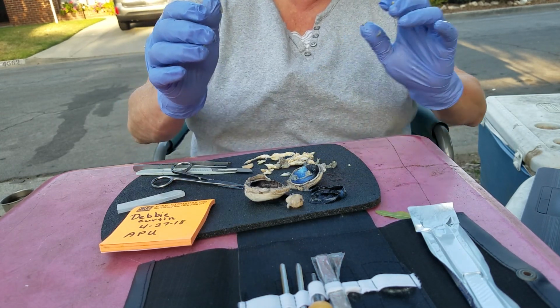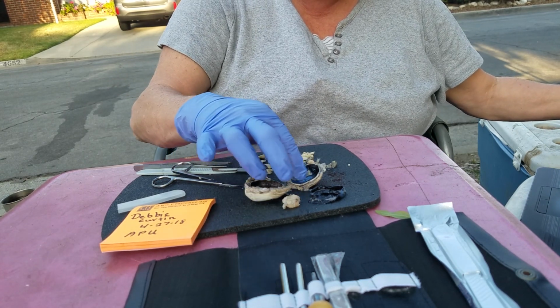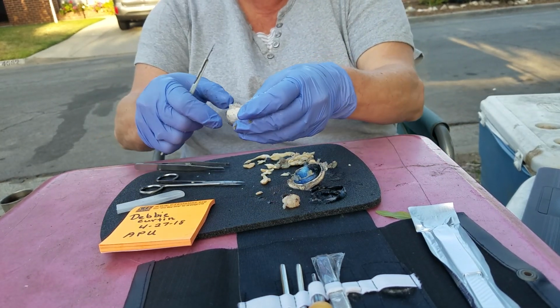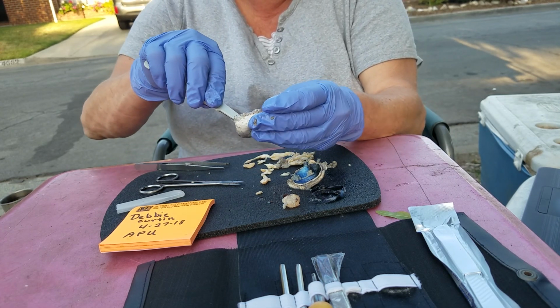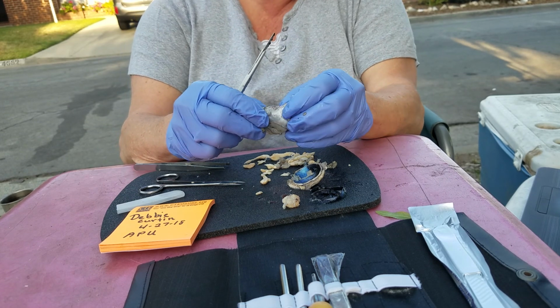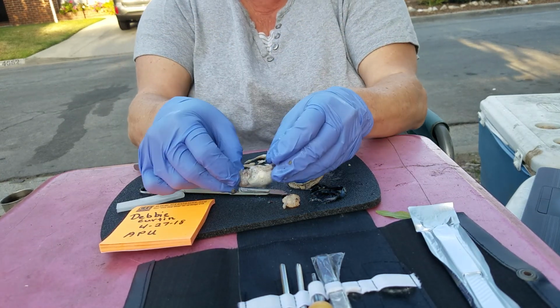Here. Again, consistency is hard. Let's see if we can scoop out the lens part of the eye now. And I'm not able to. I think I brought pretty much most of the lens out already. And once that lens is out, it leaves a cloudy substance. You can't see through it. It's very blurred, very cloudy.